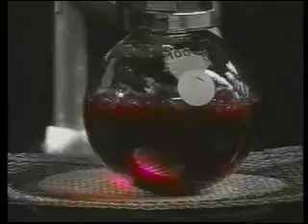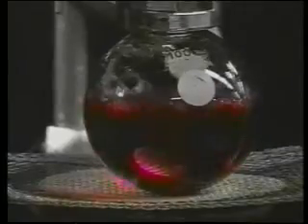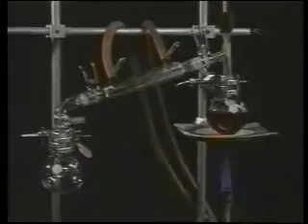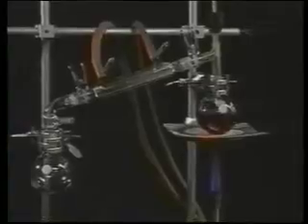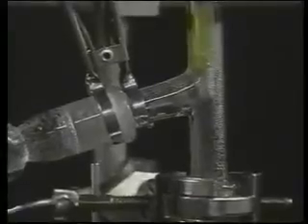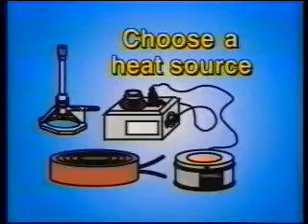Have you ever tried to boil eggs while hiking in the mountains? It takes a little longer, since the water is boiling at less than 100 degrees because the atmospheric pressure is lower. When you actually distill a liquid and measure the temperature of the vapor, it gradually increases until it reaches the boiling point of the liquid. When the vapor and liquid are at equilibrium, the temperature will remain constant until the distillation is finished.